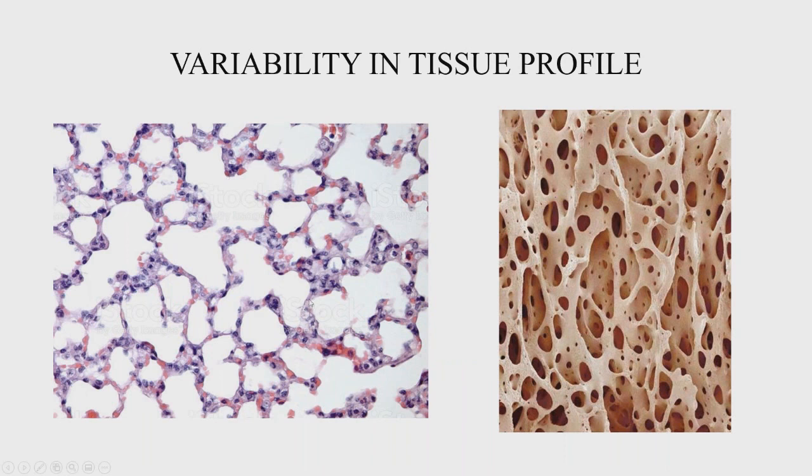Now, the next slide, I have two bigger images. The one on the left is the same image that I showed you of the lung specimen, just to show you how delicate those alveoli sacs are in the lung. You have calcifications in there sometimes, and we have to be the scientists that we are to figure out how to prepare that tissue so that we give the pathologist a visual picture just like this with no distortion.